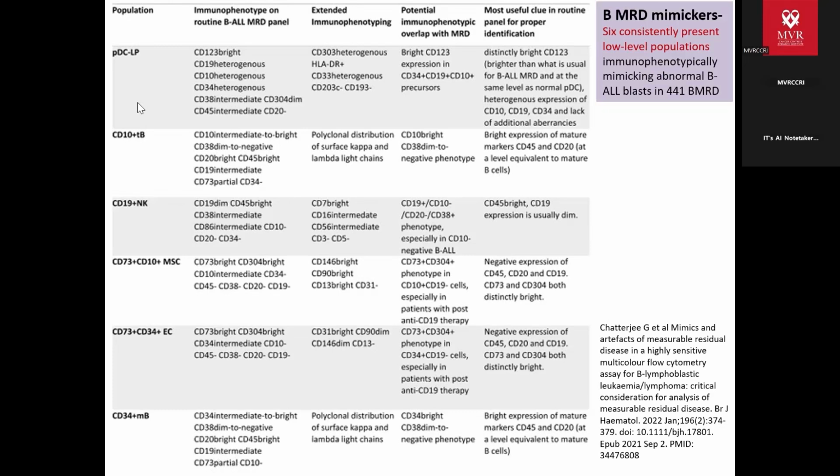So I put a limit of detection. Only if I'm getting events above 14, as of now our instrument's limit of detection is 14. Anything below 14, I'm not supposed to report, because it can be a false positive event, which I have seen in my blank cases also. Whereas limit of quantification is where I can precisely and reproducibly tell the number.